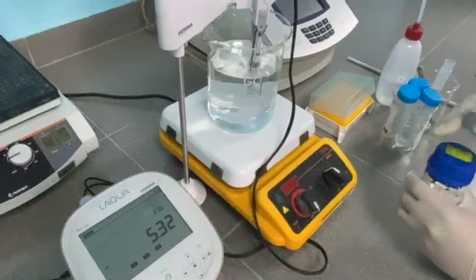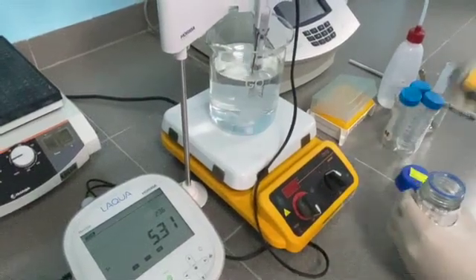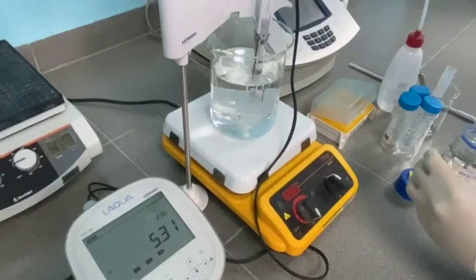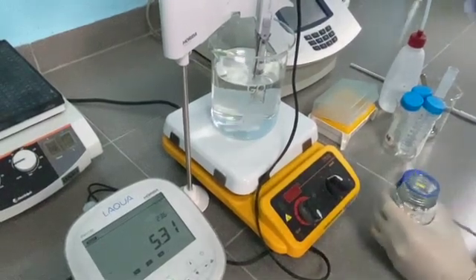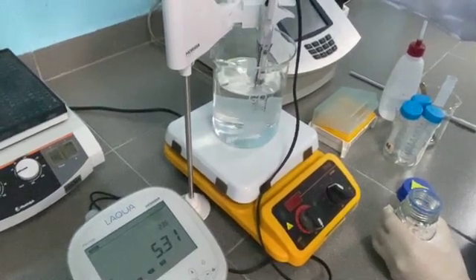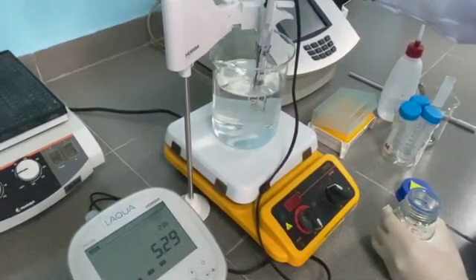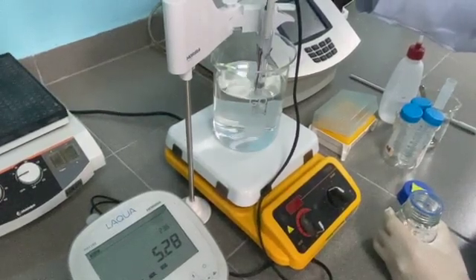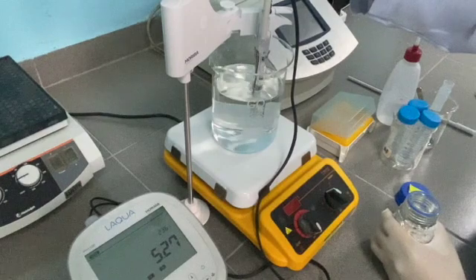We will adjust the pH of the solution. As we can see here, it is very acidic. So we will adjust with a weak basic solution, which is sodium hydroxide. We will adjust the pH until pH 7.4 before we move on to increase the volume to 1 litre.